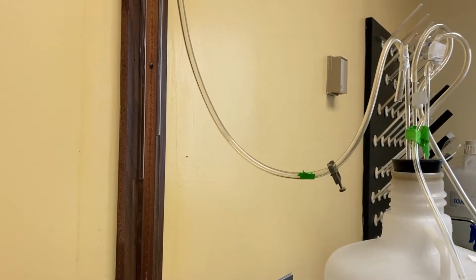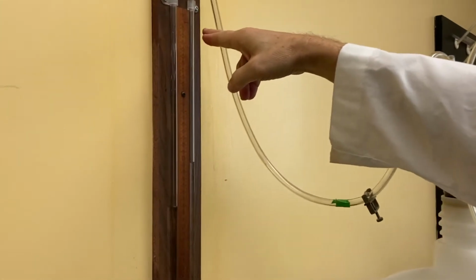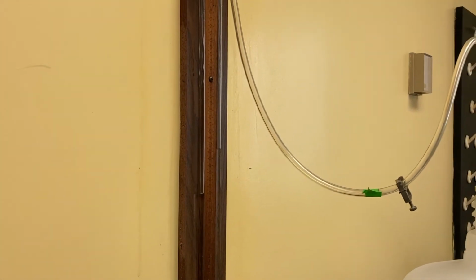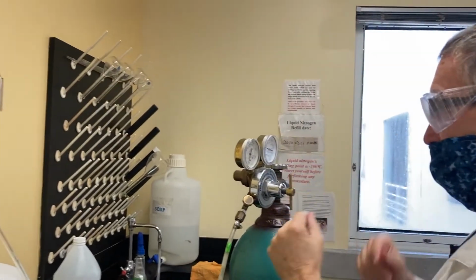Okay, the next thing we want to do is establish positive pressure. This meniscus is going to go up, this will go down, and I'll do that by adding pressure.